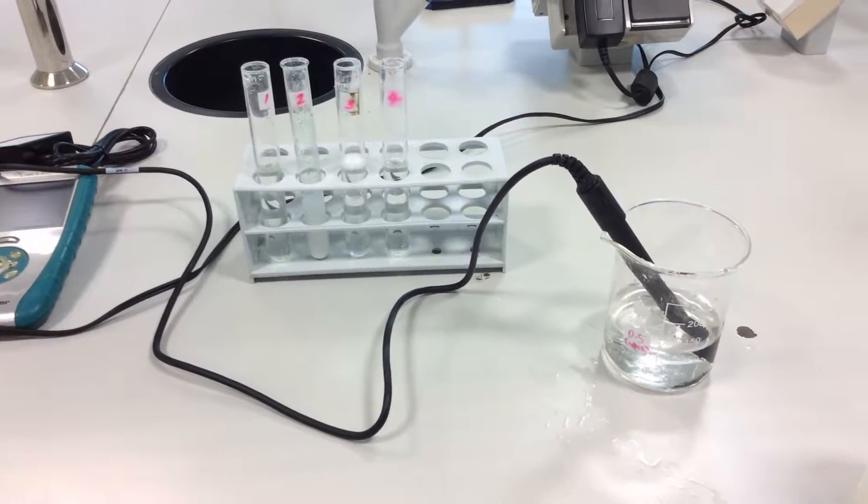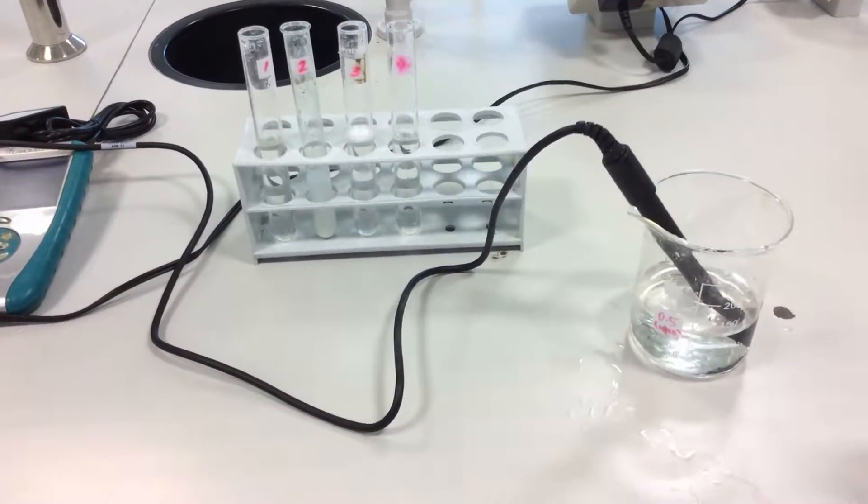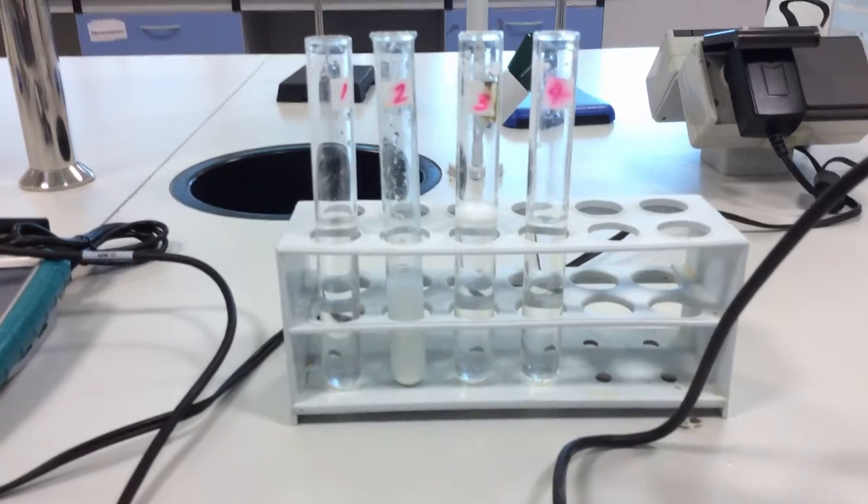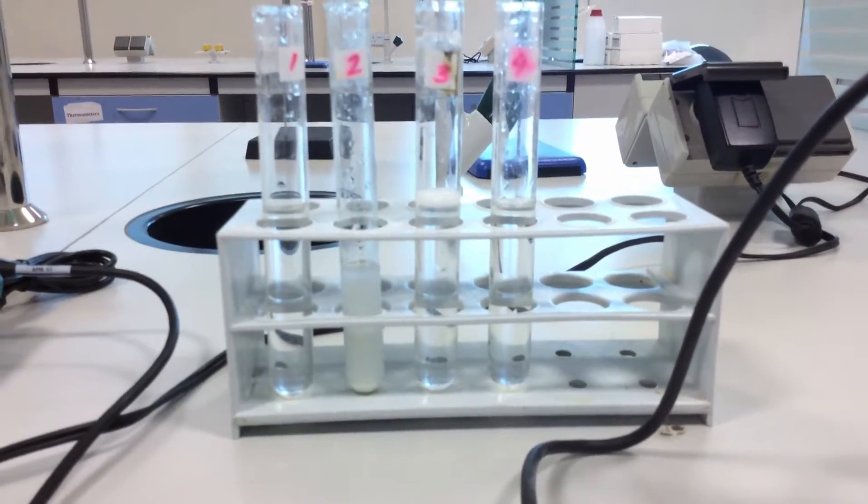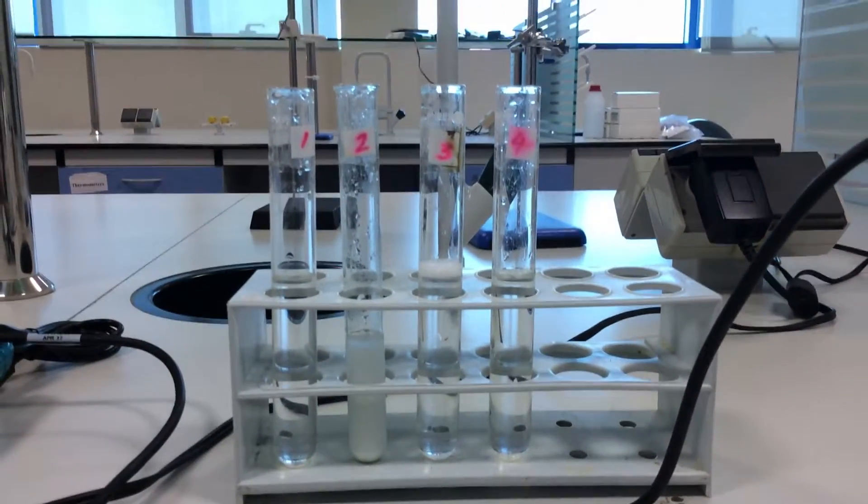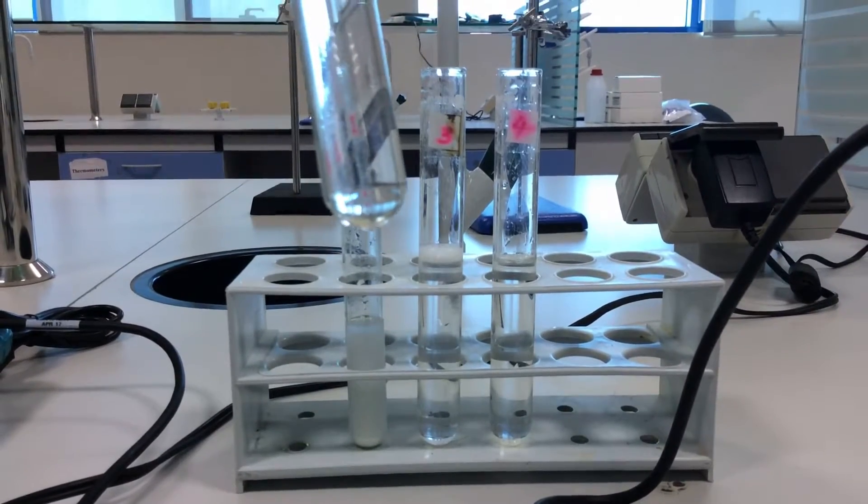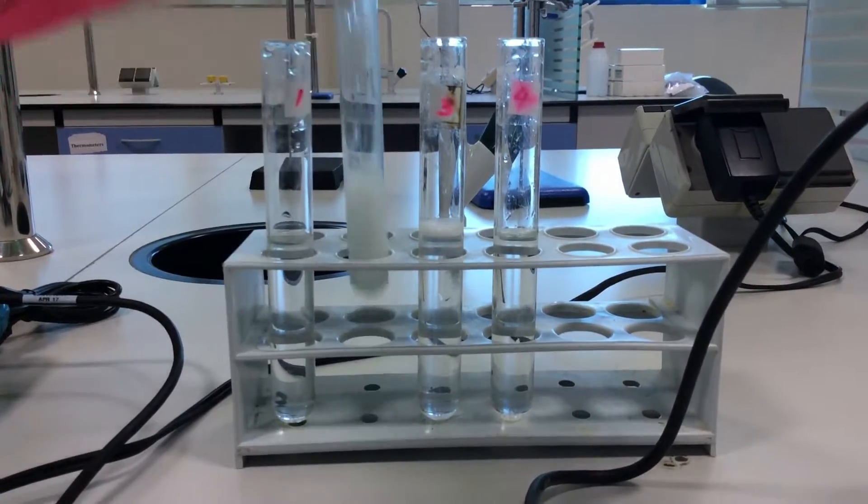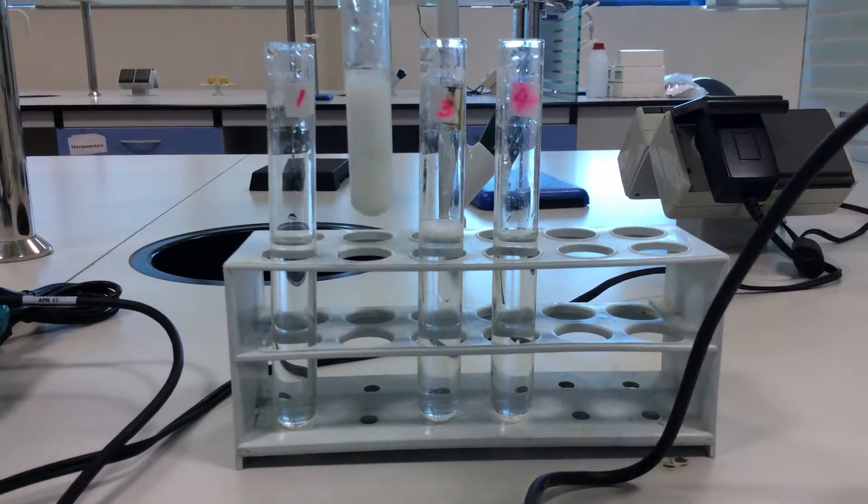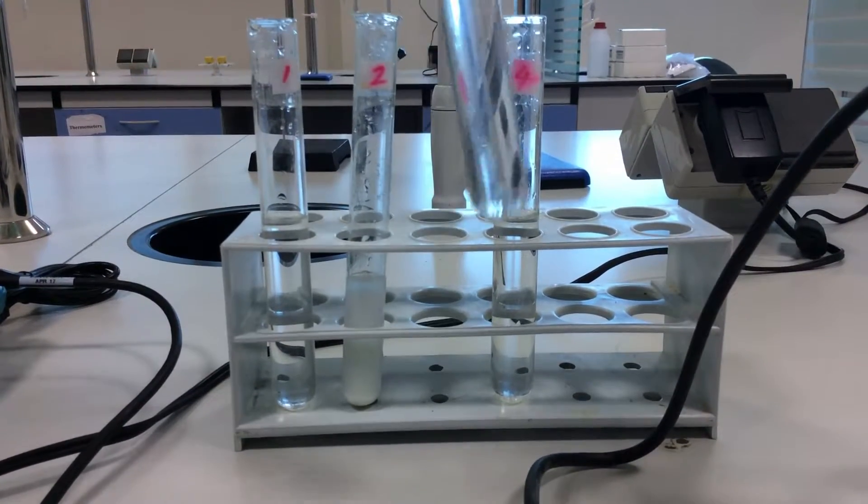Okay, now we are back with our second part of this experiment. As you can see here, we have those four test tubes. I remind you that the first one contains sodium chloride, the second one contains starch, the third one contains magnesium sulfate, and the fourth one contains glucose.